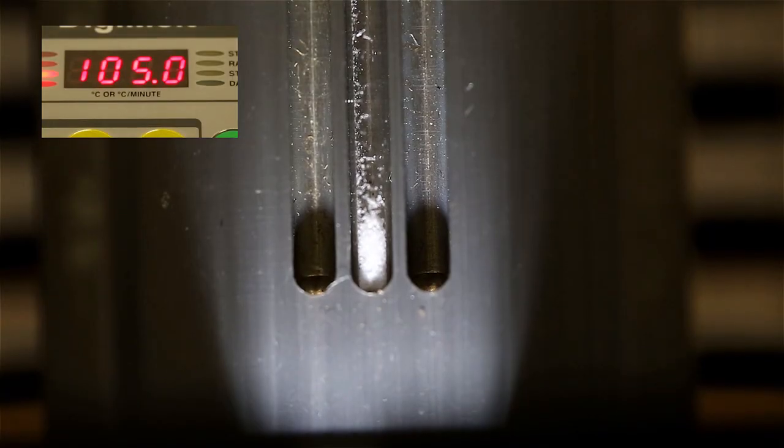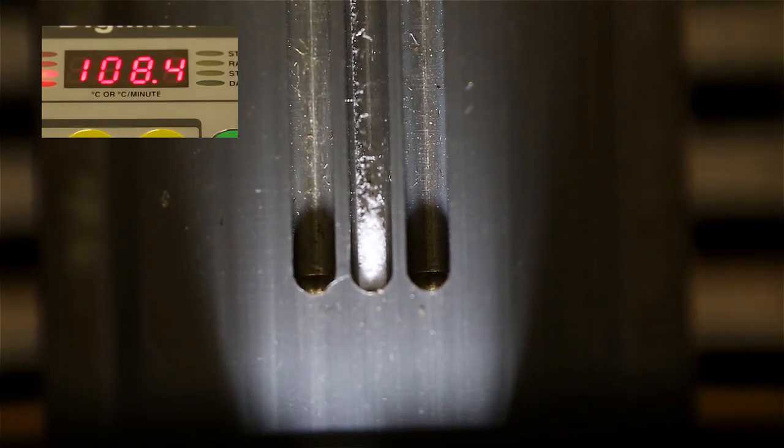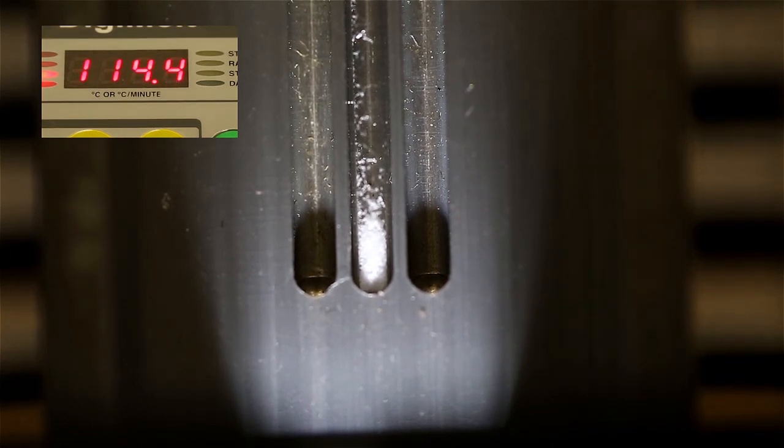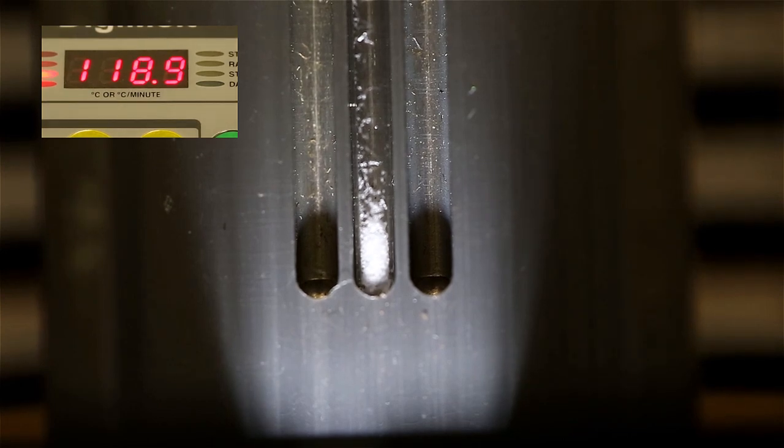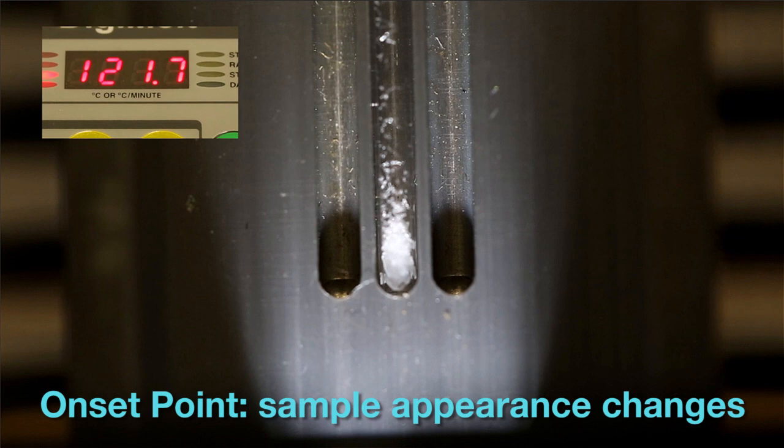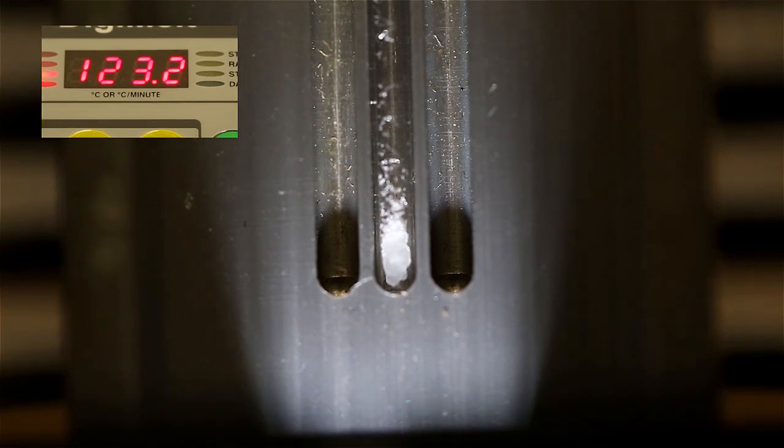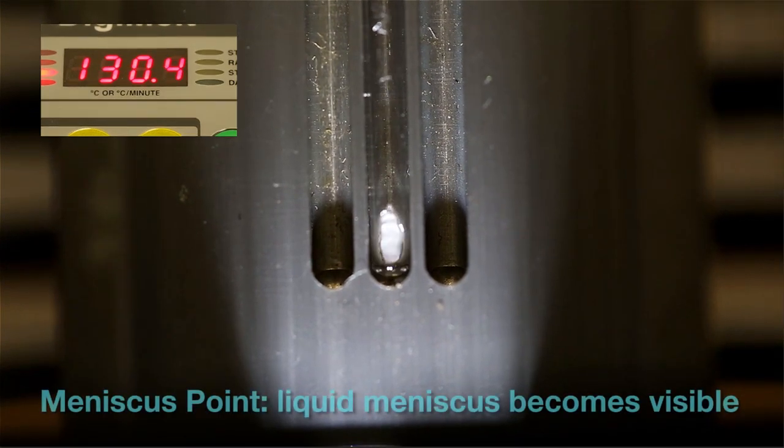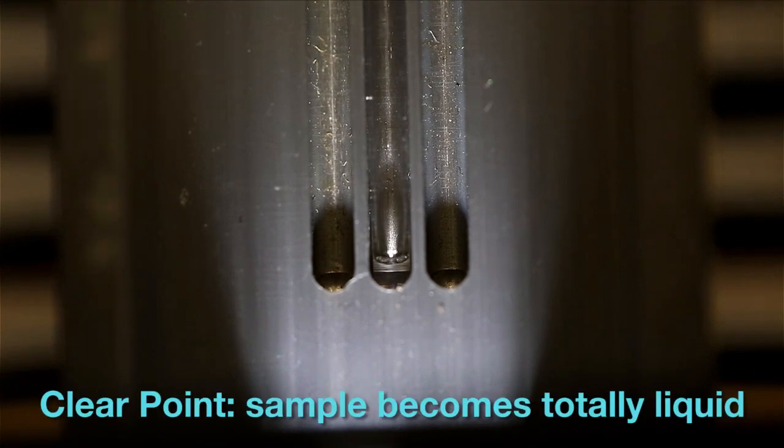There are three values associated with every melting point. First, the onset point, which is the point when the compound starts to melt. Secondly, the meniscus point, which is the point when there's equal volumes of solid and liquid. Lastly, the clear point is the moment that all solid converts to liquid form.